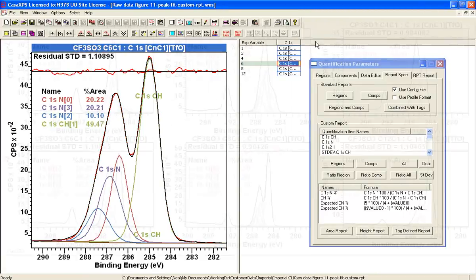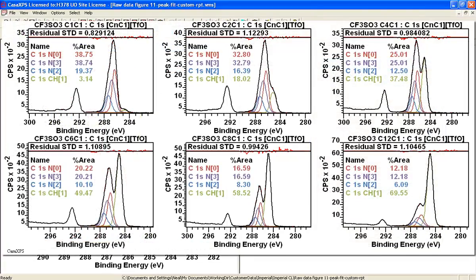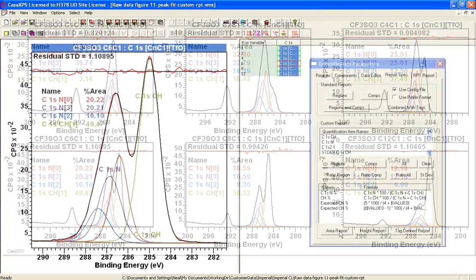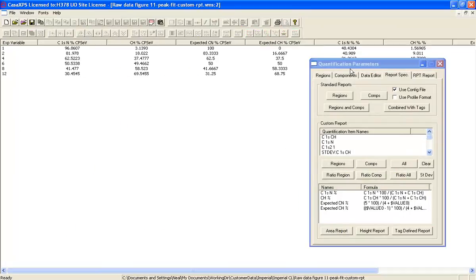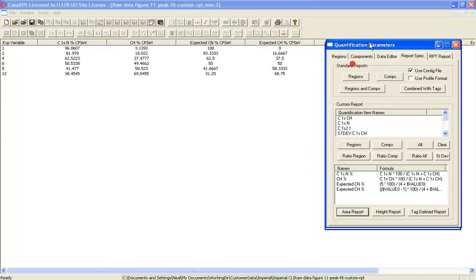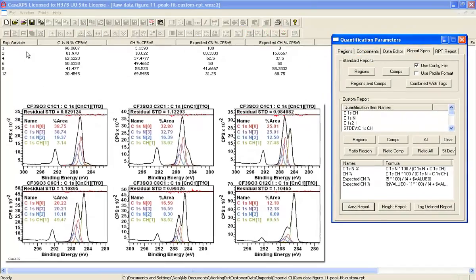The same peak model applied to a range of similar, related molecules — I do the same calculation, and we can see that over a range of different numbers of CH type bonds, we get the ratios and we can compare them to the expected ratios. And for the most part, they're doing really quite well.